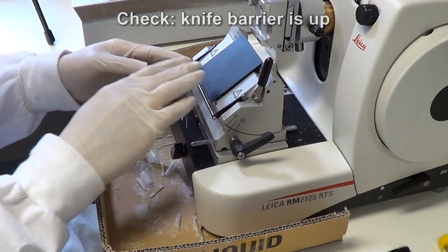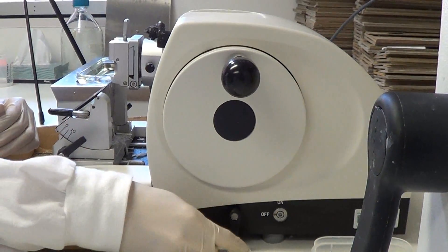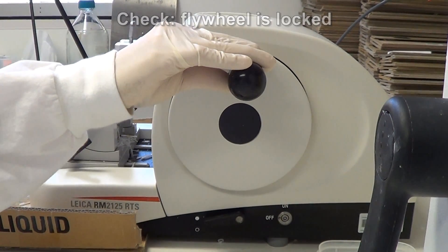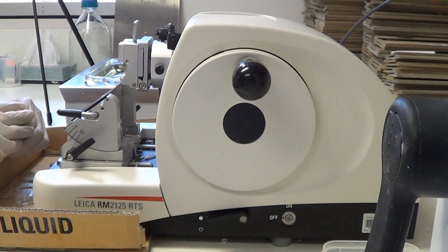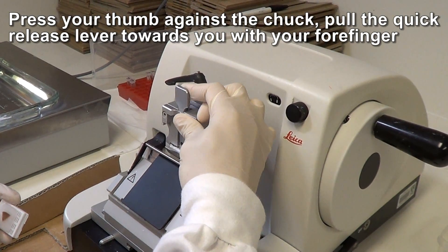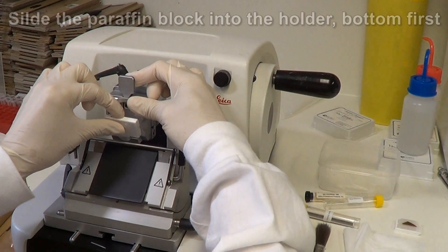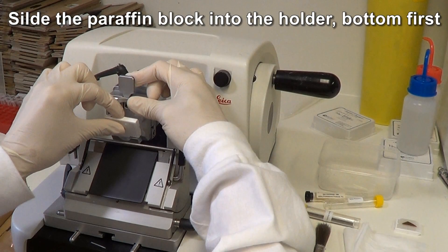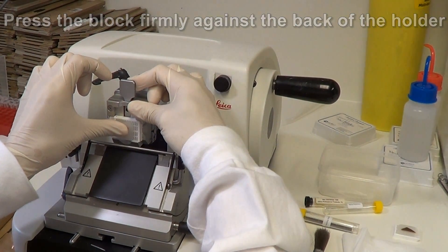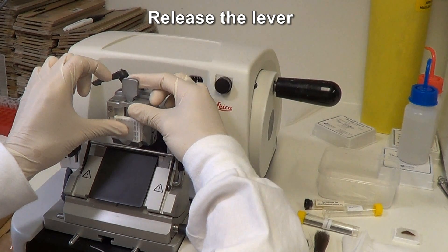Make sure the knife barrier is lifted and that the flywheel is locked. To insert the paraffin block, press your thumb against the chuck and your forefinger against the quick release lever. Then pull the lever towards you. Slide the paraffin block into the holder bottom first, then press it firmly against the back of the holder. Release the lever to clamp the block firmly in position.